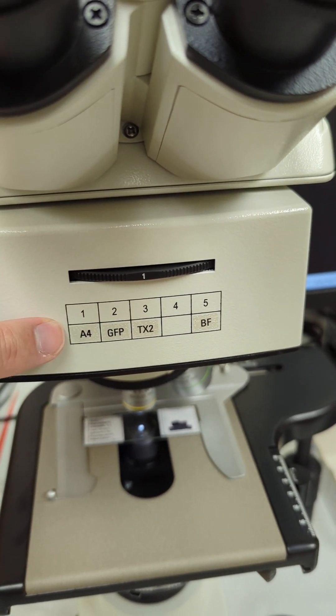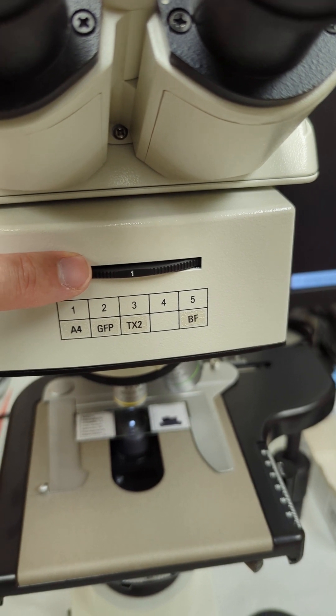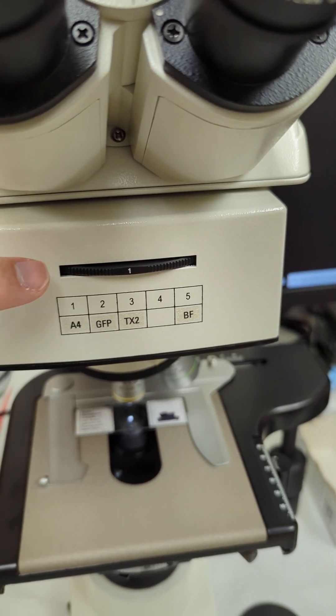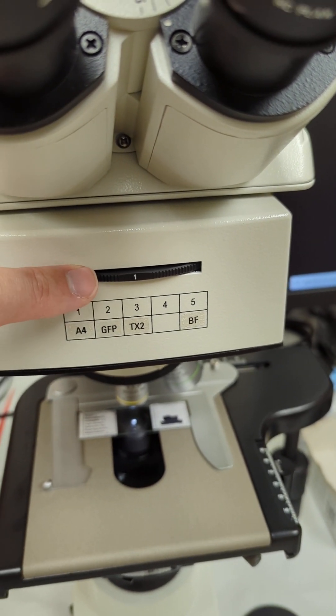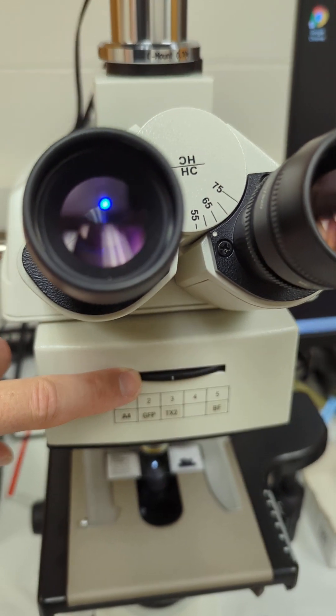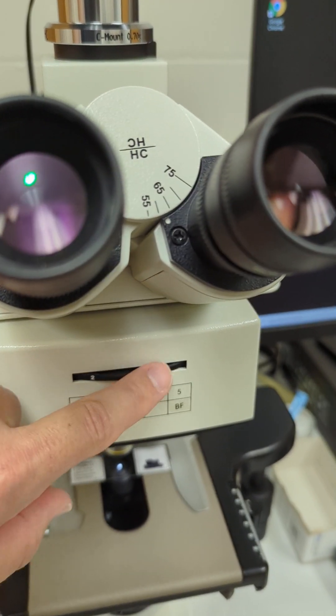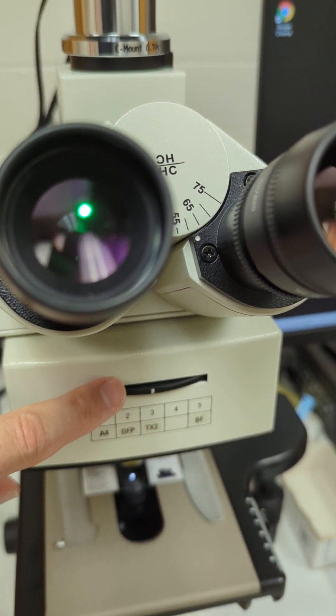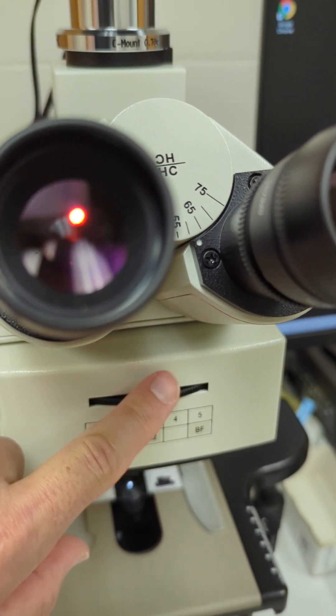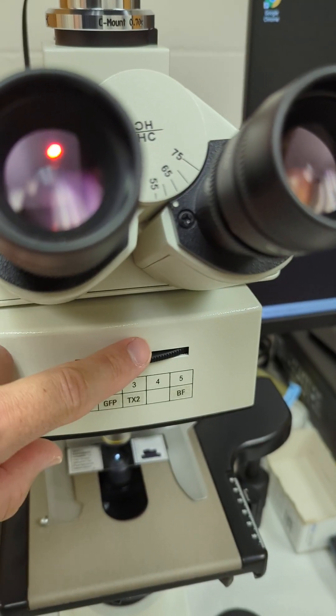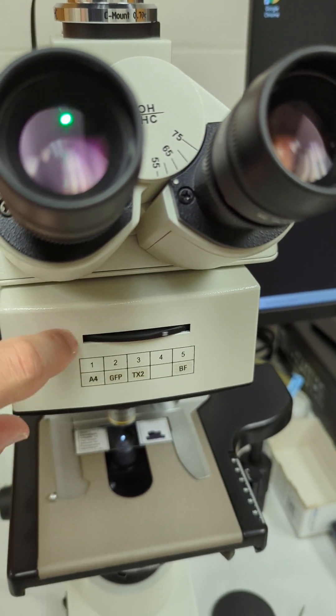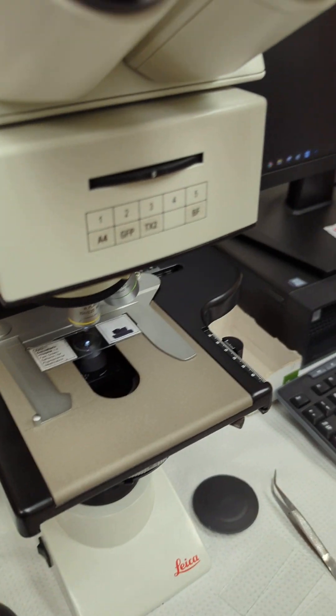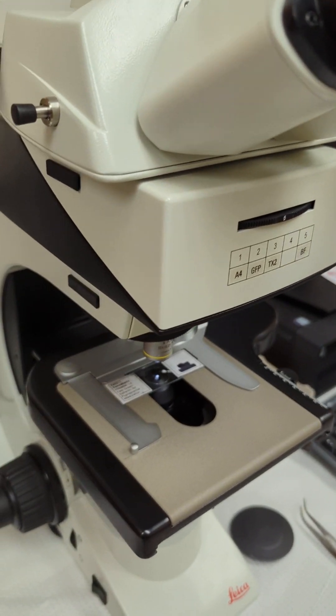We're in number one position, so now we're on DAPI. I can see through the eyepieces there's light shining through, and it's kind of purplish. You can see it. I change it and there's green, then red.